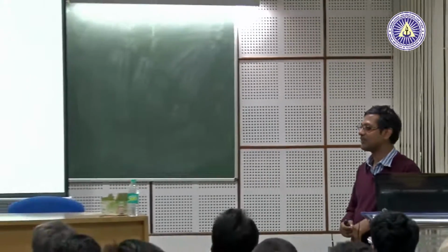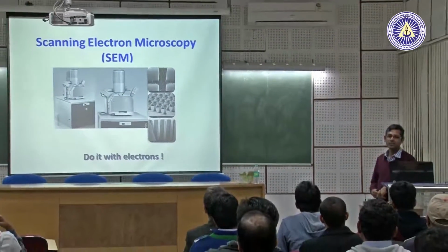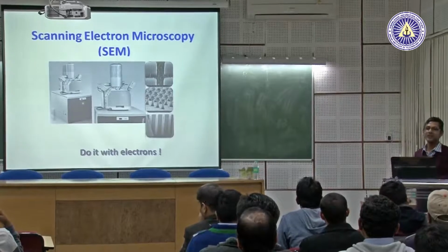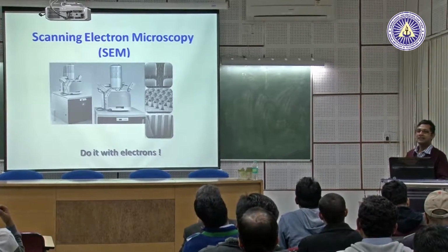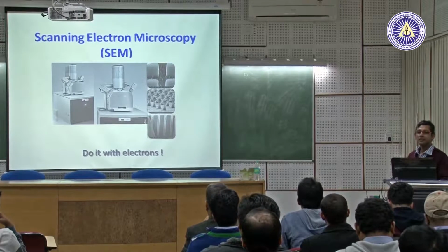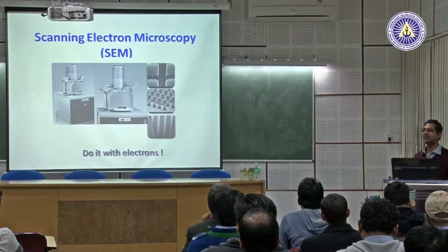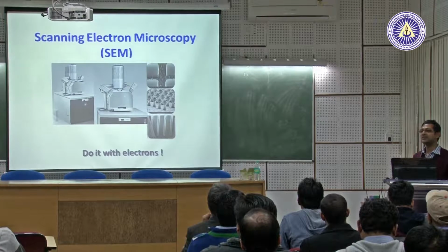I'll just take about 1.5 hours maximum to tell you some important aspects of scanning electron microscopy. And as you know, SEM is routine for materials science and engineering students and also faculty members.